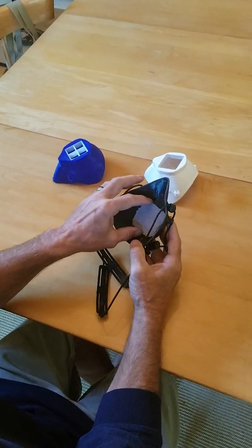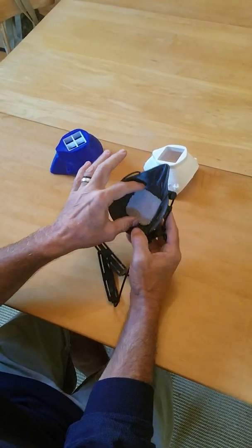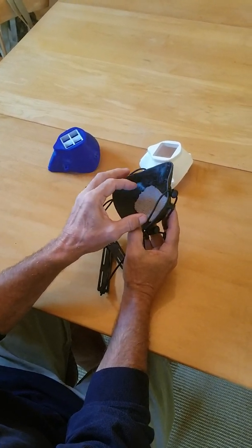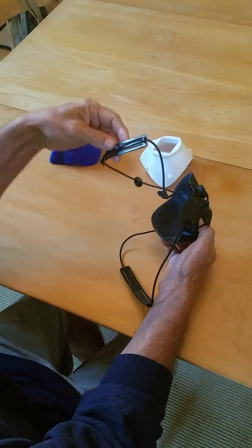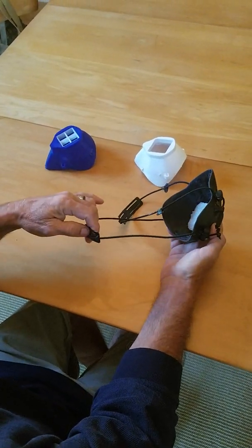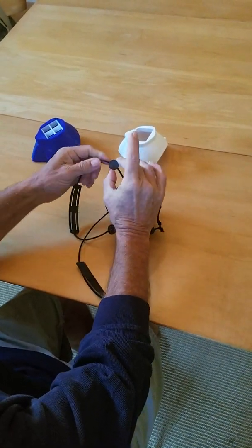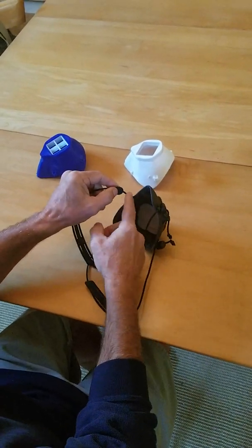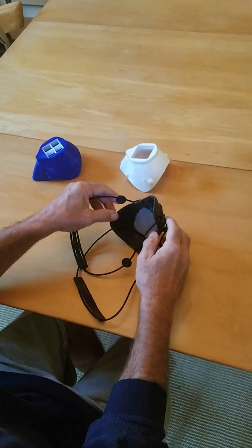One thing is, because the mask size, which I'm going to get into in a second, is not always square, this may fit better in one direction than another. Now the little characteristics of it: we have a soft band that goes around the back of the head and the back of the neck. We have these two things that slide up and down for cheek pads, so that if your cheek touches this cord, it softens it up a bit.